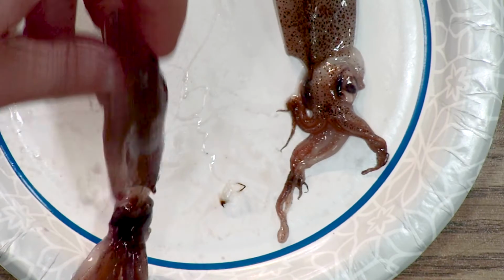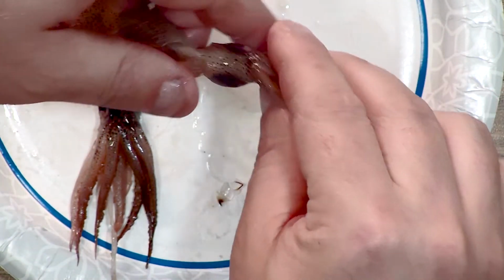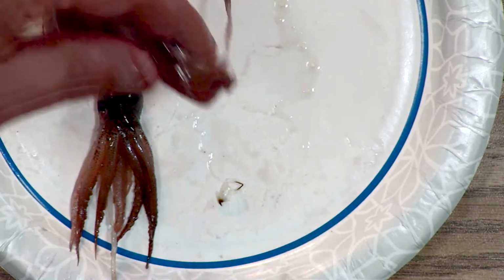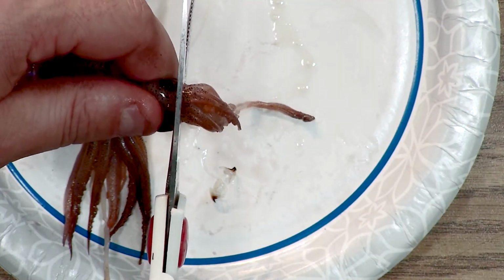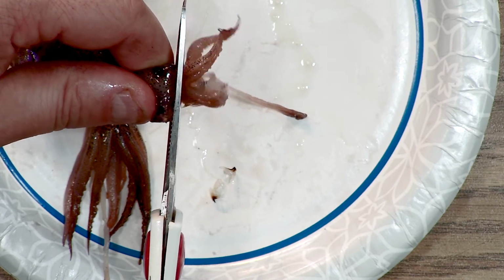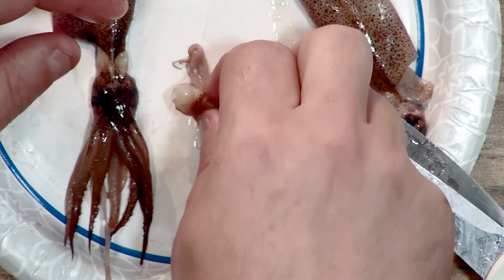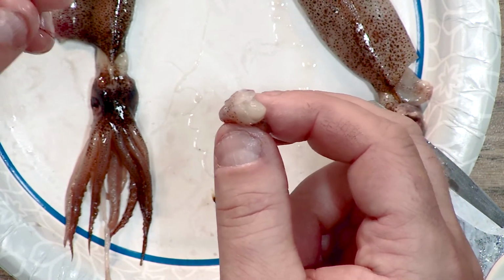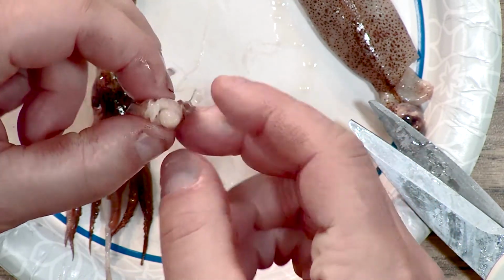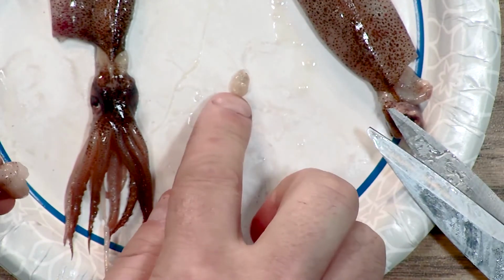Another way to do this, I'm going to show on the counterpart here. And this is the way I would do it if you were preparing food. I can actually just come in here with scissors, and I'm just going to cut the bottom off there. Now, what this does, unfortunately, is cut the nerve cord, but it quite easily makes it so I can extract the brain more intact.